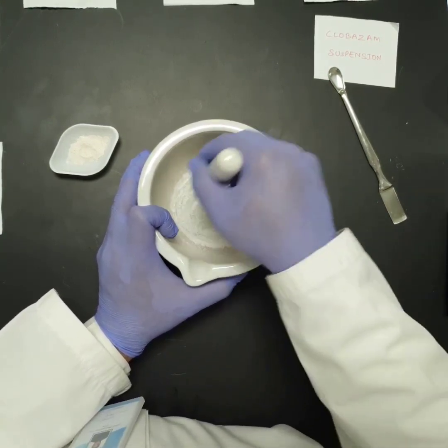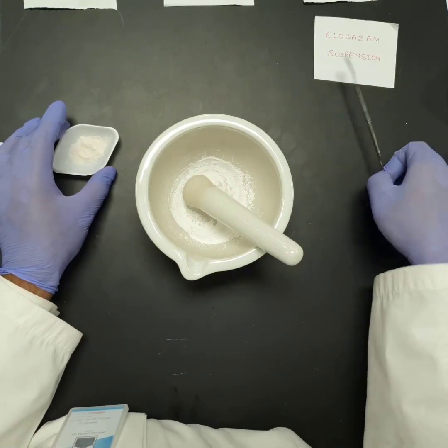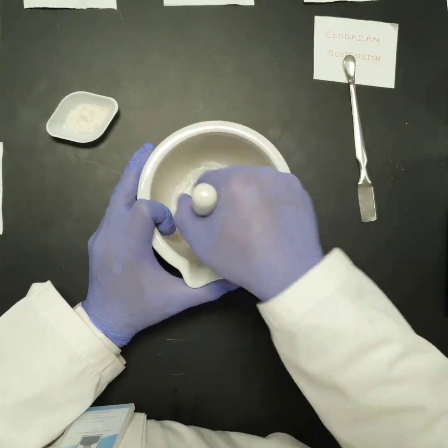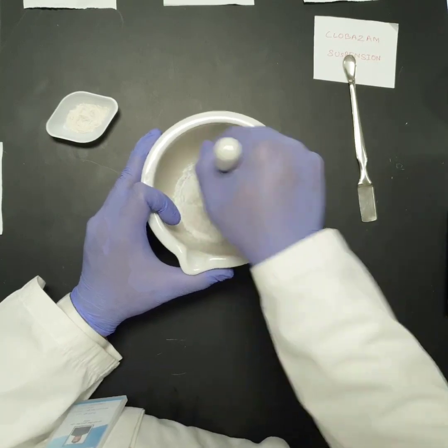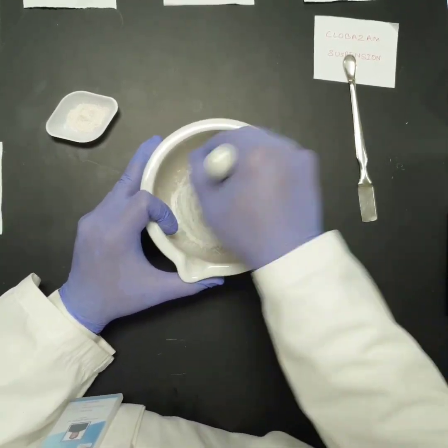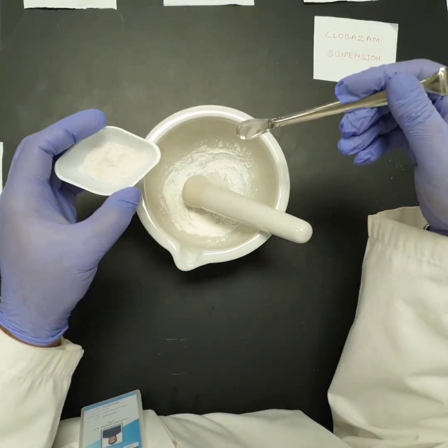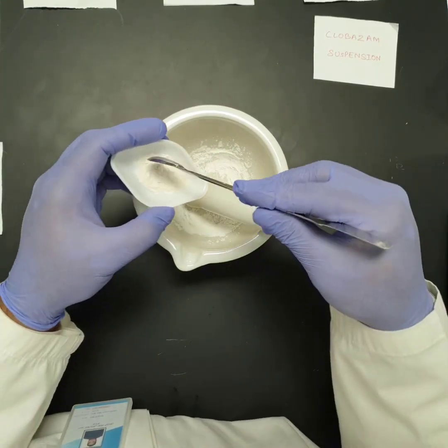So now it is completely mixed, and in our porcelain mortar we have now 200 milligram of powder. So it's time to add more 200 milligram. So now I'm going to mix again. So we have 400 milligram of powder in our porcelain mortar, and if we are going to use the geometric mixing technique or doubling up technique, we have to double the amount which is there in our mortar. So 400 milligram means we have to take more 400 milligram.